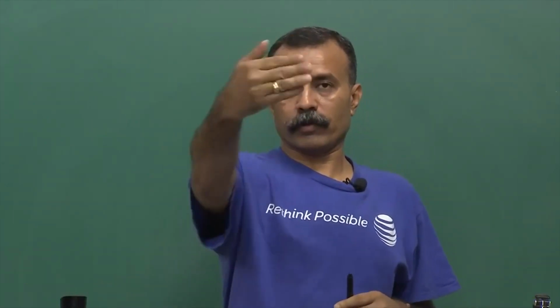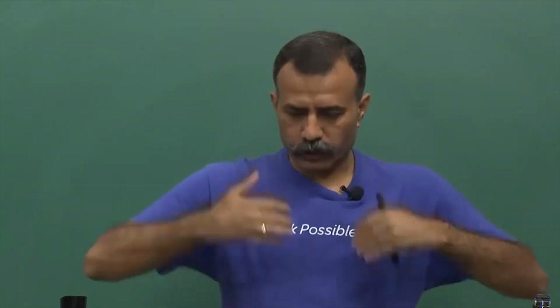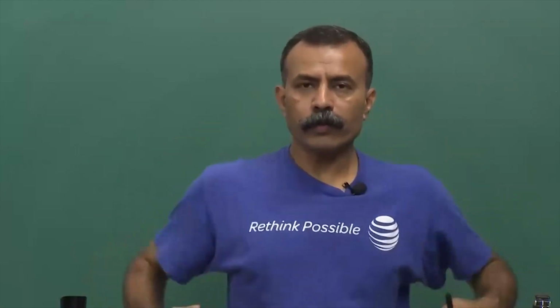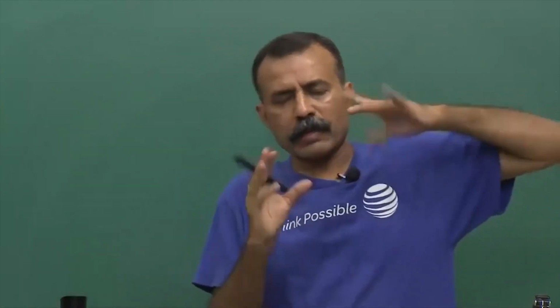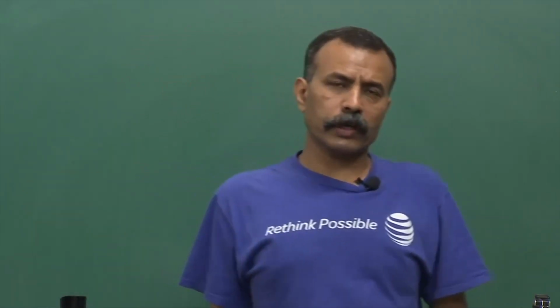The second is where air is flowing from the back side towards the front. What you are looking at is the front, and from the back side, air is flowing towards you, like this. So there are modifications, something like a semi-hybrid and all those kinds of things, but do not get into the complexity. Just keep in mind you have two kinds of laminar flow hood, a vertical laminar flow hood and a horizontal laminar flow hood.